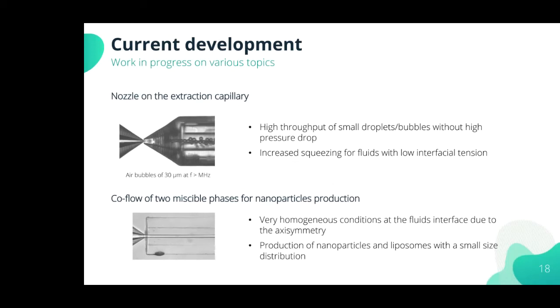Then we can also use the device to generate co-flowing fluids to produce nanoparticles or liposomes at the interface. And in this situation, the advantage is that the interface is very homogeneous because of the axisymmetry of the design.